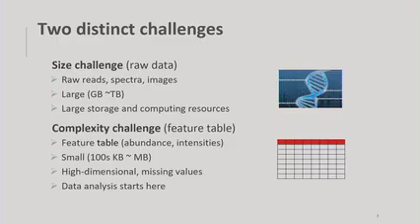It's taking time, but more or less it's computing, processing data by data, and it should be automated. I always envision it like driving a Tesla. So more or less it's going to be standardized. This is our concept: raw data processing takes time, but it should be standardized, automated, and shouldn't be a challenge.